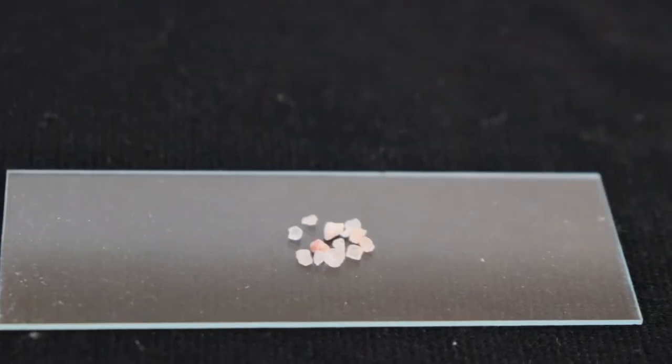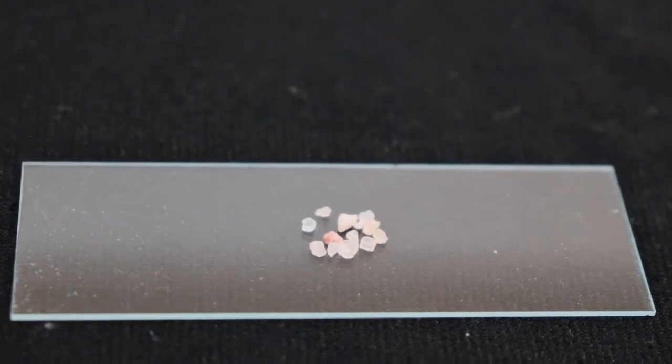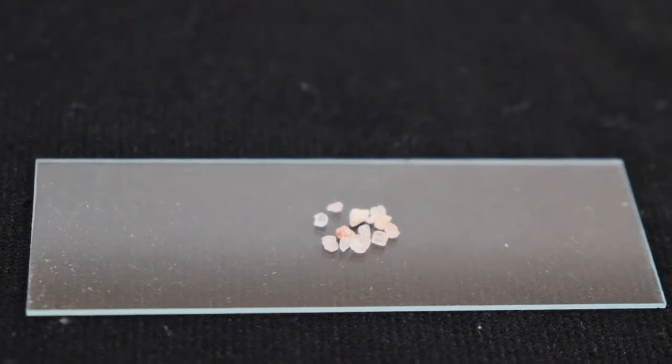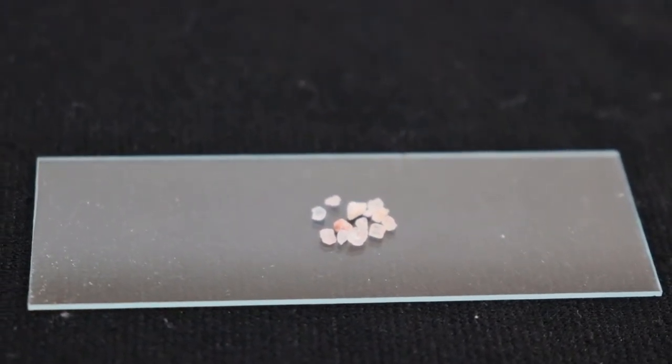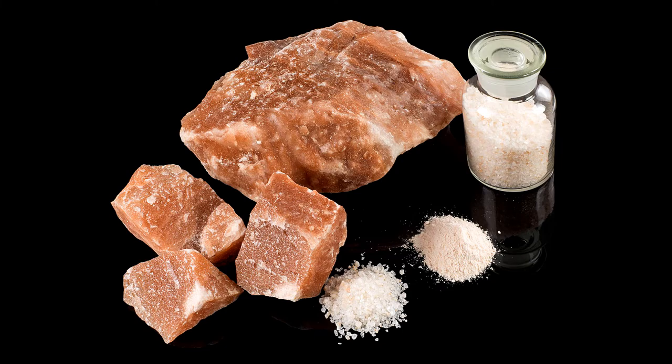Alright, okay, this is Himalayan salt. It's bigger than sea salt and regular salt. Okay, let's look at this inside the microscope.